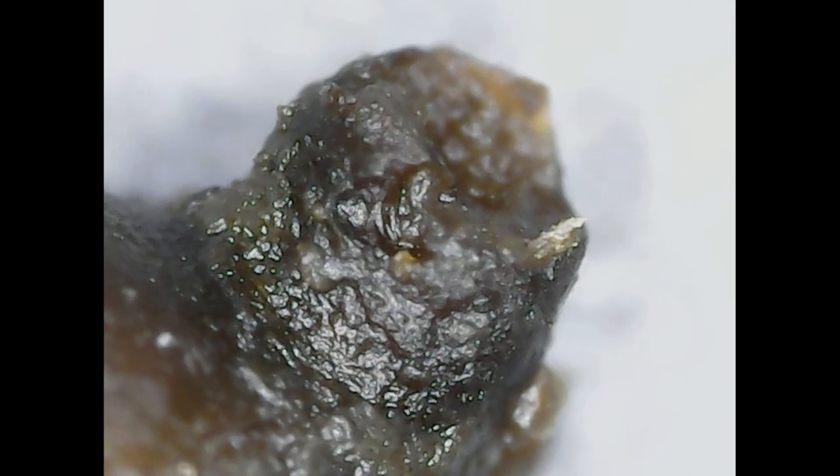It's a little rough. Here's the opening that the worms will, sometimes they split, but a lot of times this end kind of opens up and they come out of it. This looks closed though, so I don't think this cocoon is hatched. There's the other end. No little critters crawling around on it.